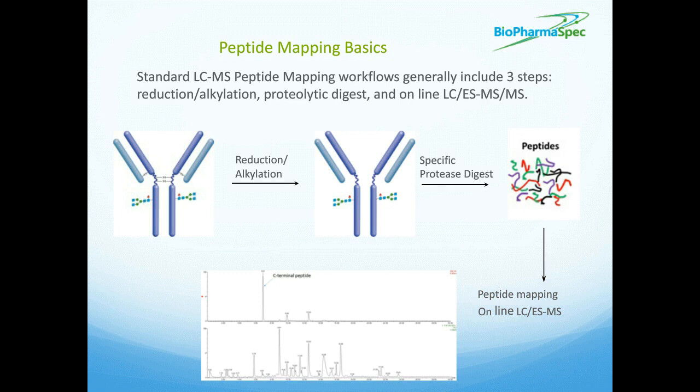Modern mass spectrometers, such as a QTOF type instrument that we use here, are capable of generating fragment ions from these peptides at the same time as generation of intact mass peptide data. The fragmentation ions obtained are used to confirm the identity of the peptide, again, through the generation of amino acid sequence information, which can then be used for either database interrogation or protein identification in the cases of protein mixtures or unknown proteins. Or we can compare back to the expected sequence of a known protein.